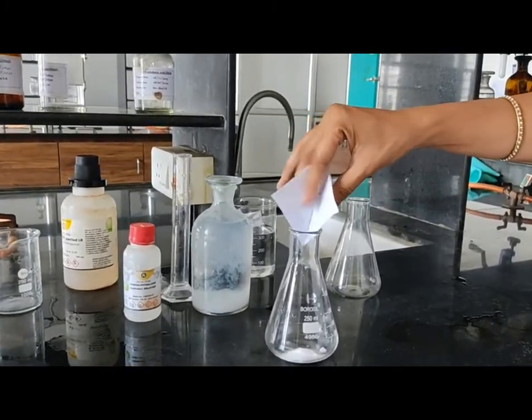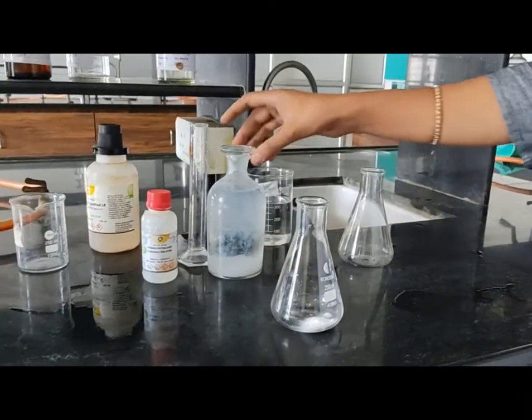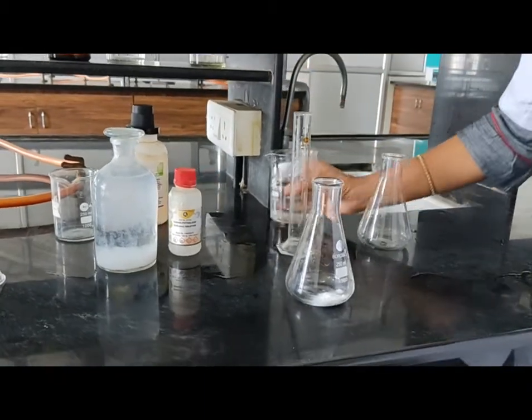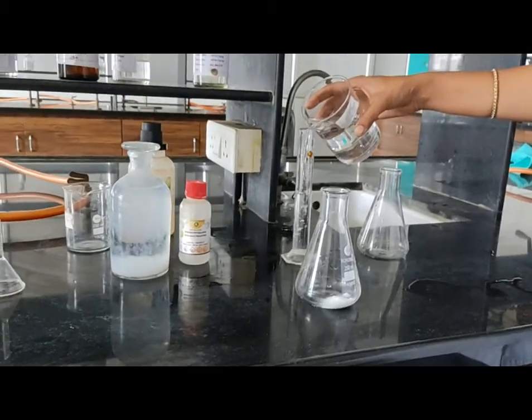Now add this 5g of potassium hydrogen phthalate into the 250ml conical flask and dissolve it into 75ml of carbon dioxide free water, distilled water.